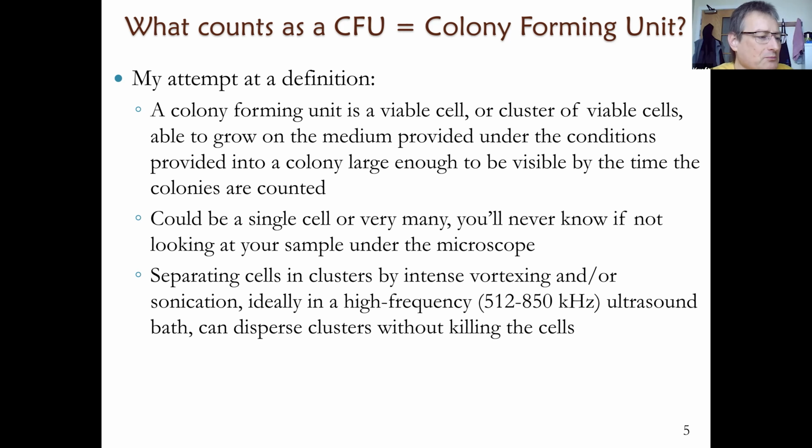treatment, whether you are separating cells or killing the cells. So at a suitable frequency and power, you can disperse clusters without actually killing the cells. That's possible, but it has to be tested. If your viable count, if your colony forming units are increasing due to the treatment, then you're not killing them, but separating them.